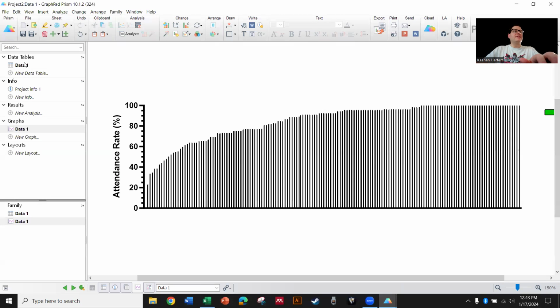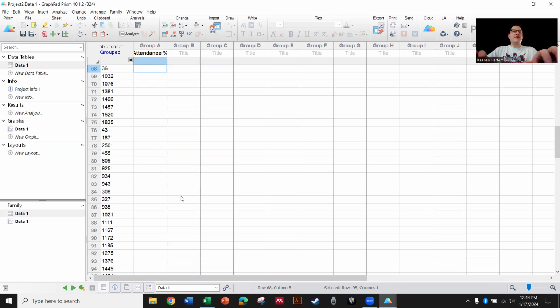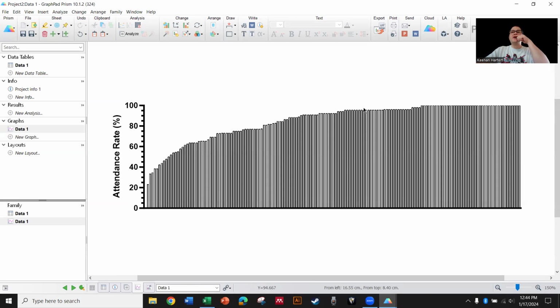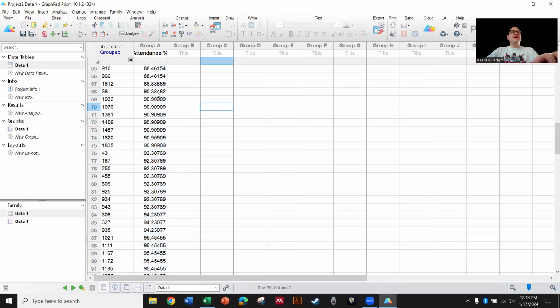Yeah, it certainly didn't like that very much. Yeah, so hence sometimes things get a little unfortunately wonky with how the bar graphs decide to be put up if they want to. My intention was to take everybody that's above 90% and then color those bars green. I might come back to that. This always happens to me though.